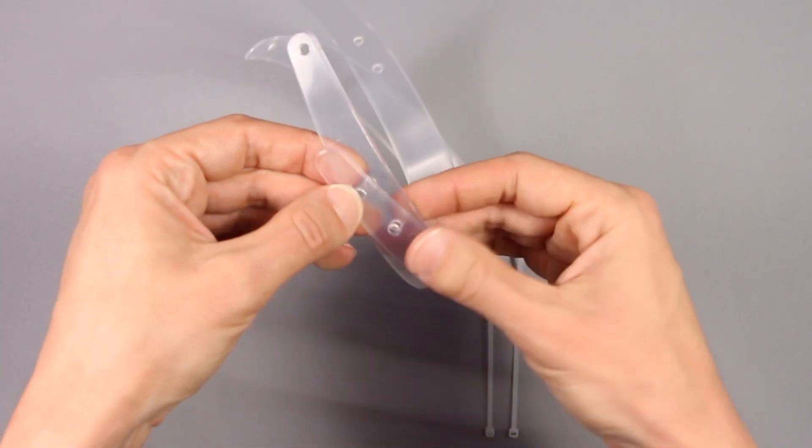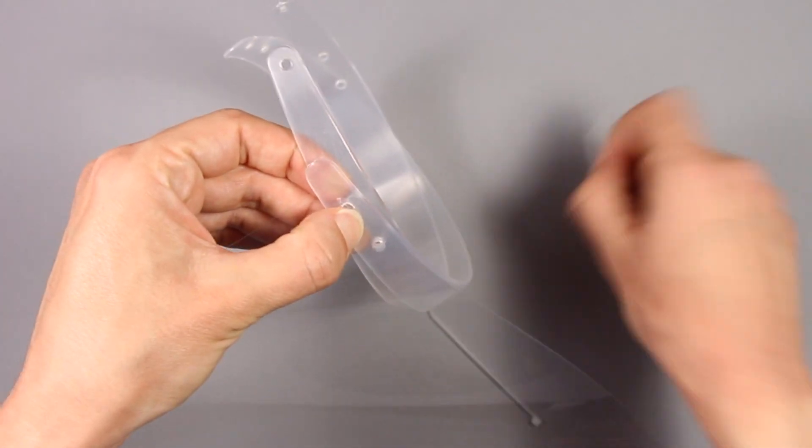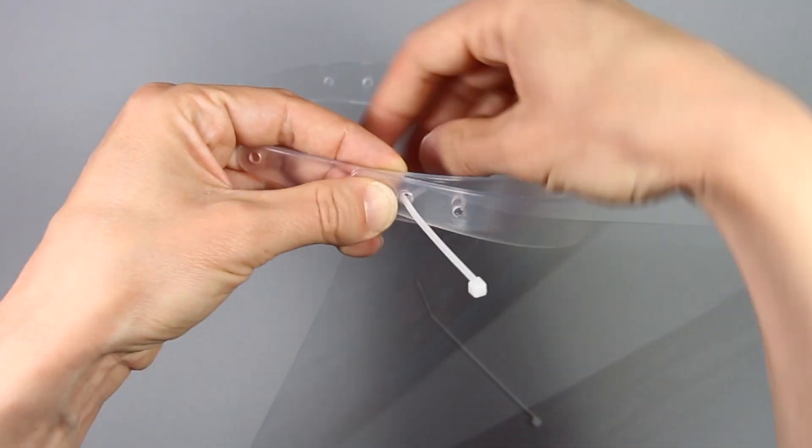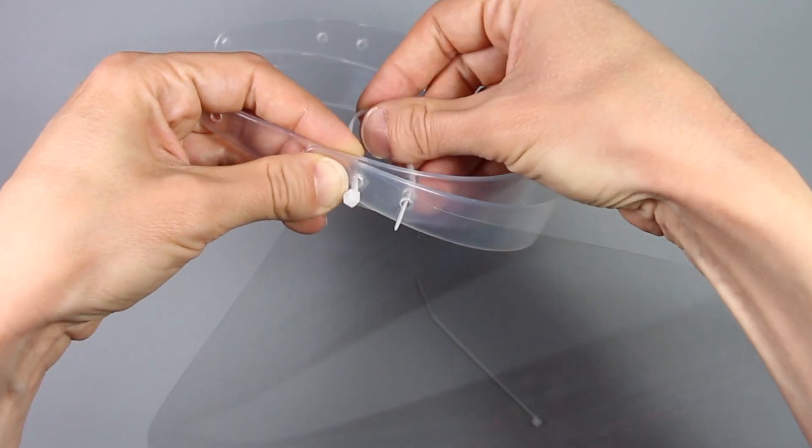Align the headband holes with the holes in the plastic. Insert the zip tie through the shield plastic and the two headbands from the outside. Pull the zip tie through and insert it back through the other hole.